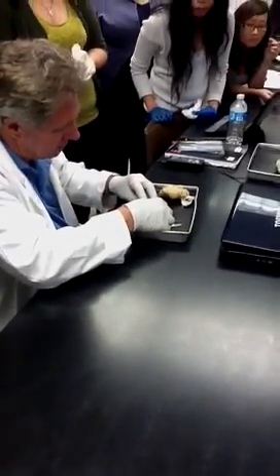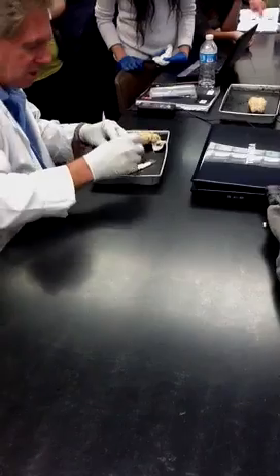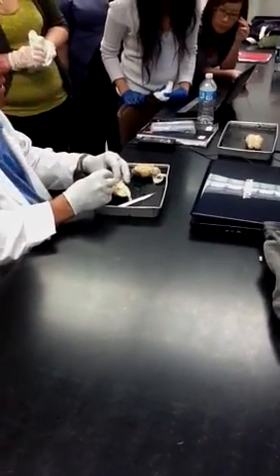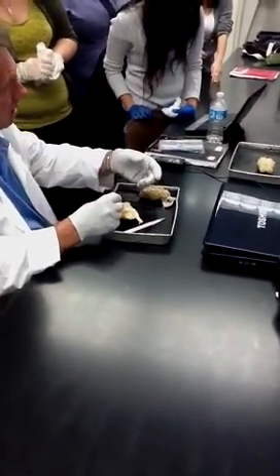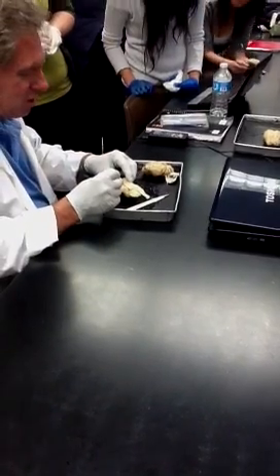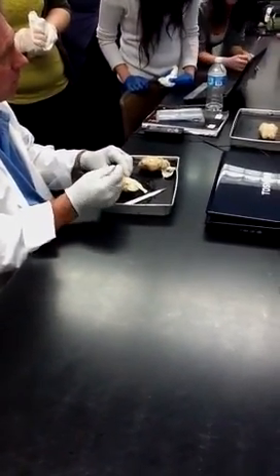Pull it back, well, it's not going to work very well. But maybe. Kind of separate this and open it up a little bit like that. That's where the lateral ventricles are. So there'd be a lateral ventricle on this side and one on the other side. And on this one, I just ruined it. But there was a thin little layer of tissue right there, the septum pellucidum. You'll be able to see it in some of yours.